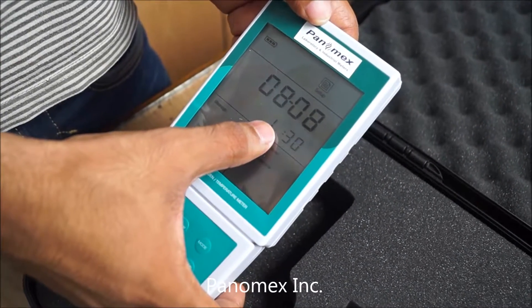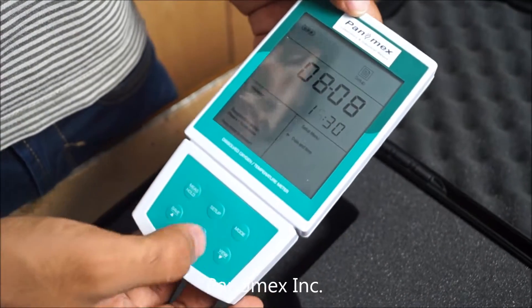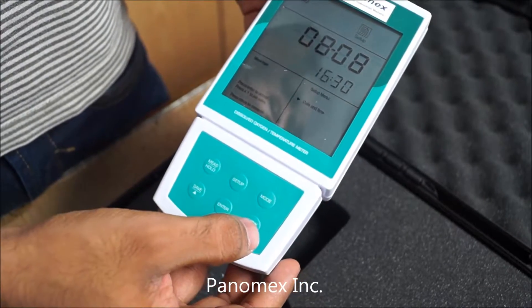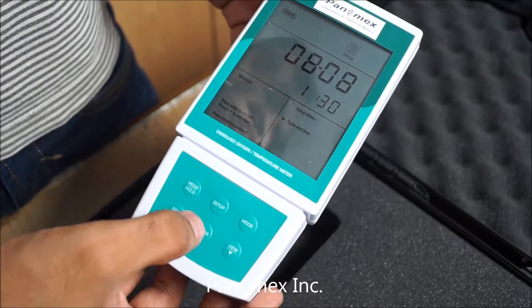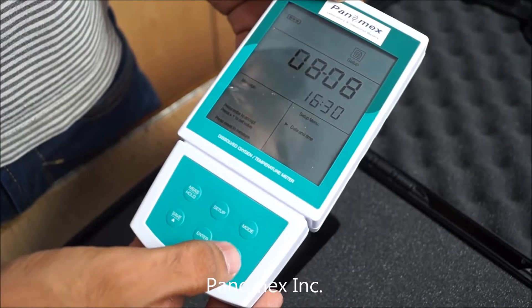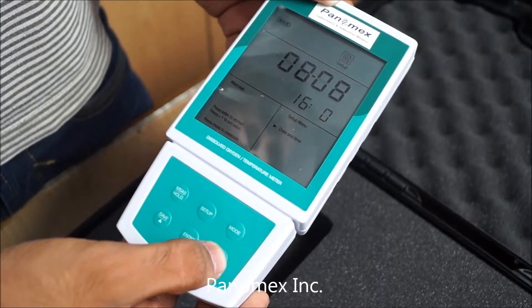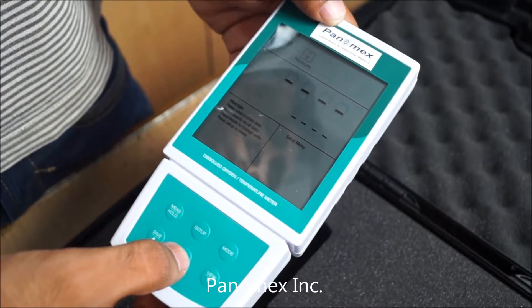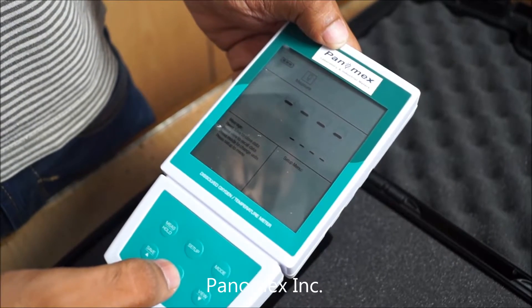This is the hour and this is the minute. You can change them using the up and down keys. Now your time is set.